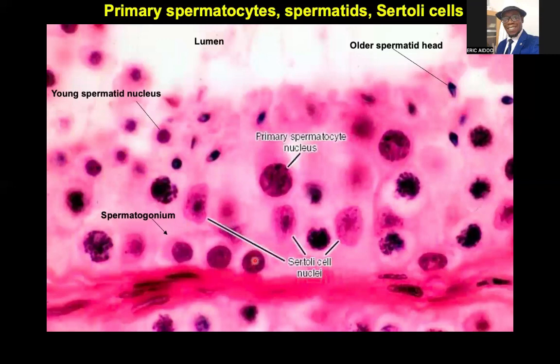So at this base, you are going to have these ones to be the spermatogonia. They are in touch with the base. Depending on whether they look dark or pale, you can tell whether it is an A pale or A dark type.